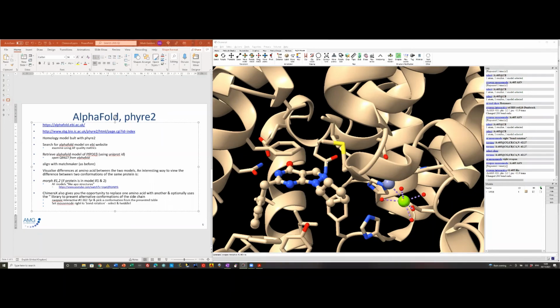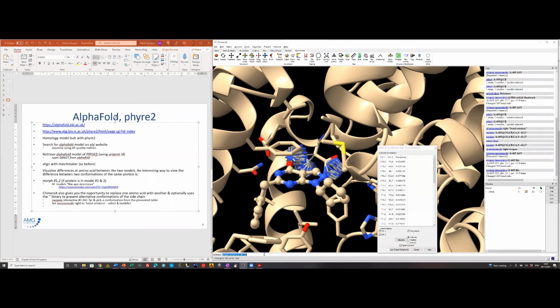So in this case, I'm going to change this residue here, and the interactive element gives you options from the Dunbrack rotamer library for Chi1 and Chi2 angles, and gives you the prevalence, so you can click through some of the more prevalent ones and see which one might be more relevant to you.